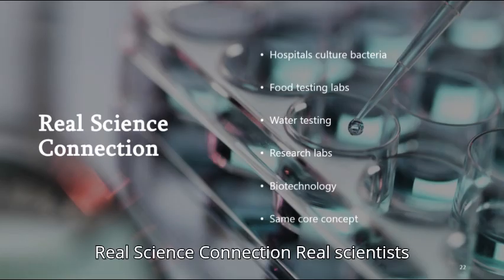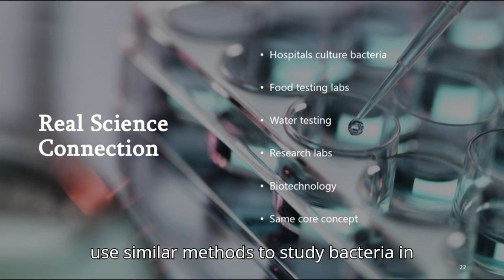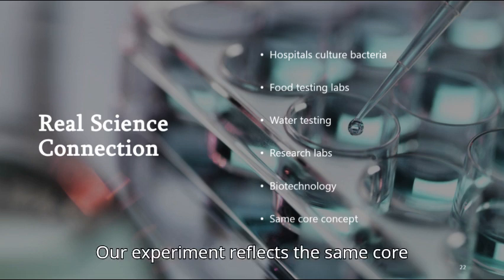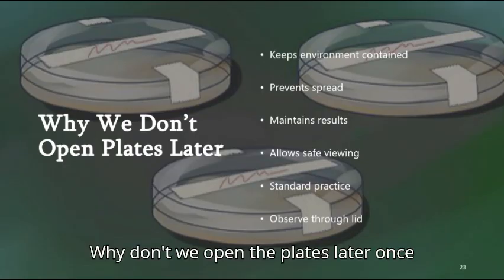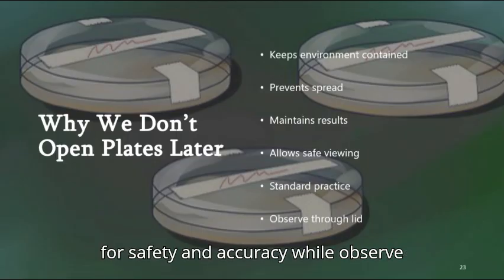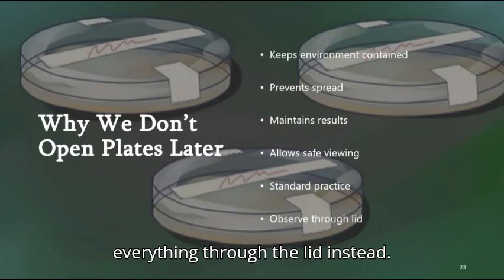Real science connection. Real scientists use similar methods to study bacteria in hospitals, labs, and the environment. Our experiment reflects the same core microbiology techniques. Why don't we open the plates later? Once bacteria grow, we keep the plates sealed for safety and accuracy. We'll observe everything through the lid instead.